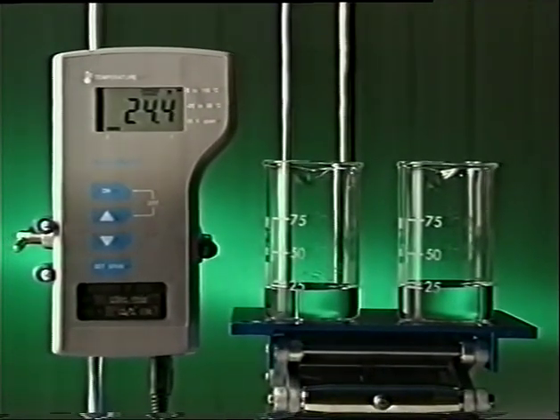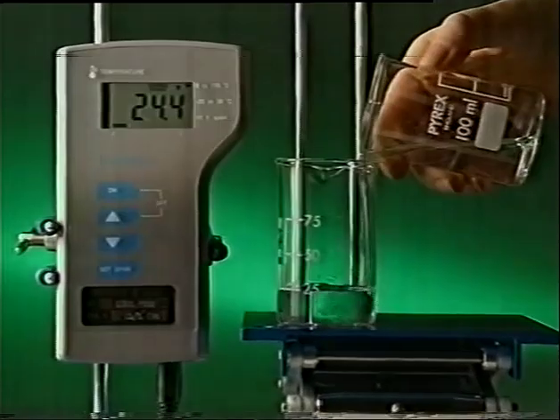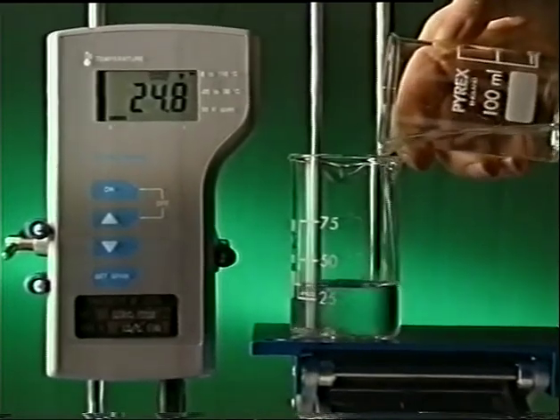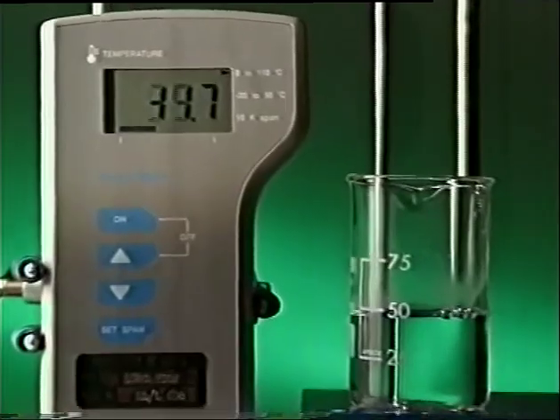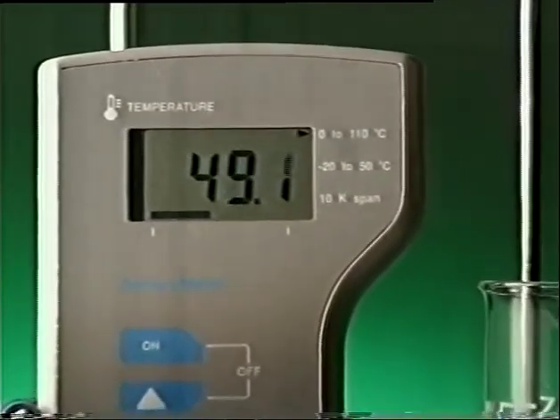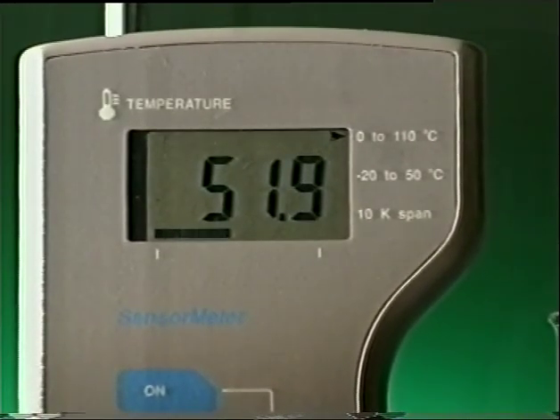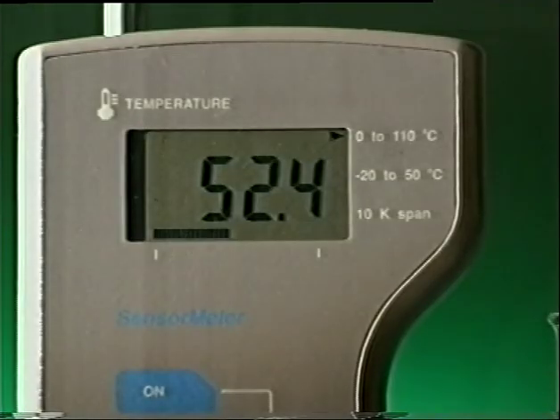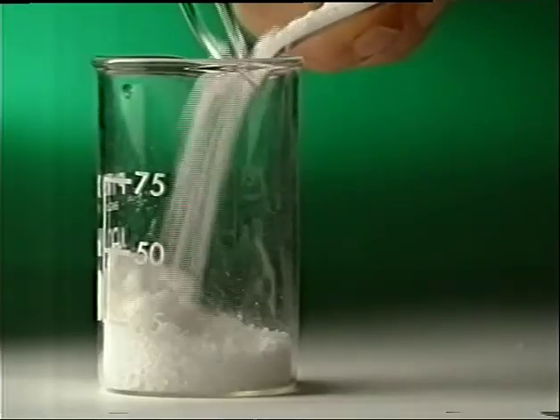The reactants start off at 24.4 degrees Celsius. Add them together and the temperature of the reaction mixture quickly rises. Heat energy is being given out, so it's called an exothermic reaction. But not all reactions give out energy.